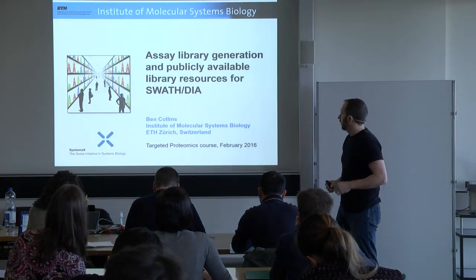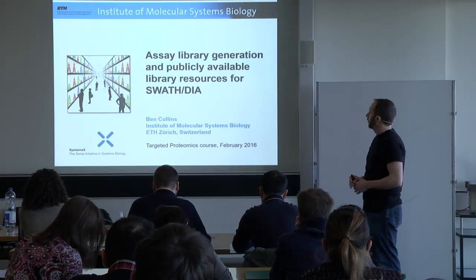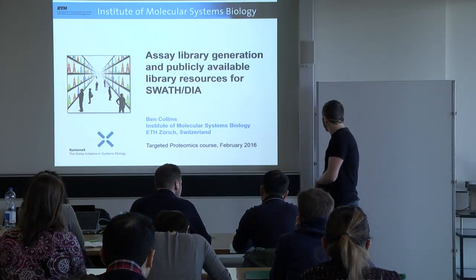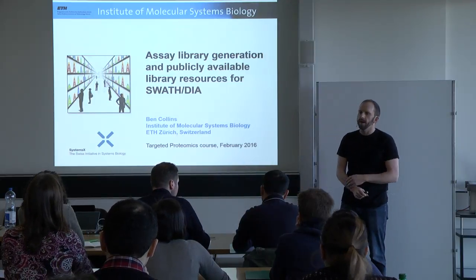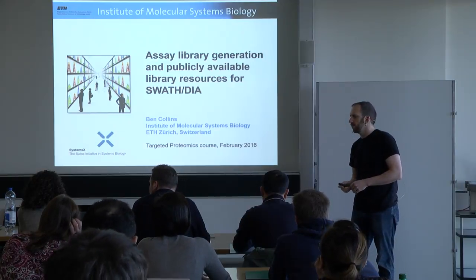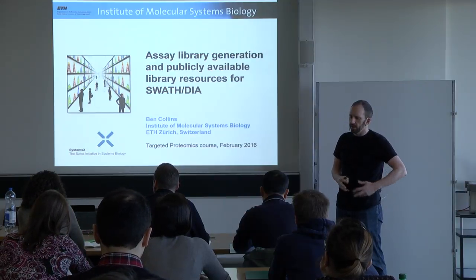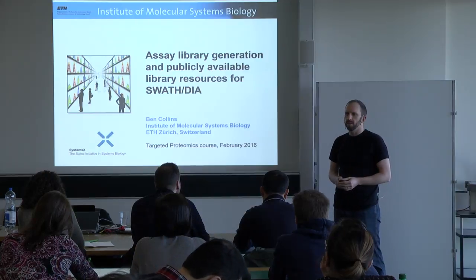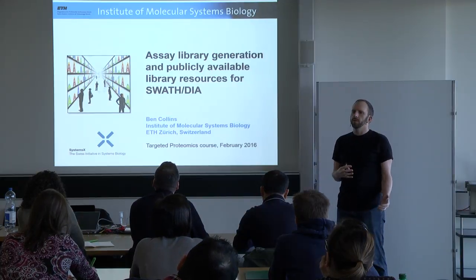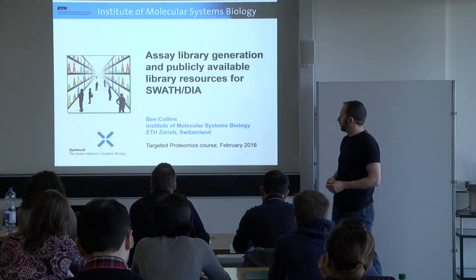So the purpose of this lecture is, we said many times during the week that assay libraries are important in targeted proteomics. This has been a theme. And on Monday, Ariel mentioned in brief terms how you might do this for SRM assays. And on one of the days, in tutorial 3, you actually built some spectral libraries, but we haven't gone very deeply into the detail of where these come from, and this is really the purpose of this talk.